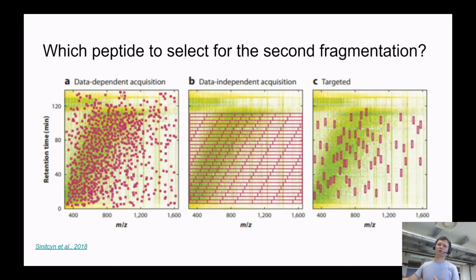We measured with data-dependent acquisition. We had a lot of missing values, but we came up with some very smart statistical ways to find proteins which help to distinguish between groups. You can use a support vector machine, you can use some more fancy method, but we come up with a classification, and with the most important features of this classification. Cool. And now, after building this classification model, you know that soon many more samples are going to arrive, and doctors are going to wait for the answer, which group each sample belongs to.